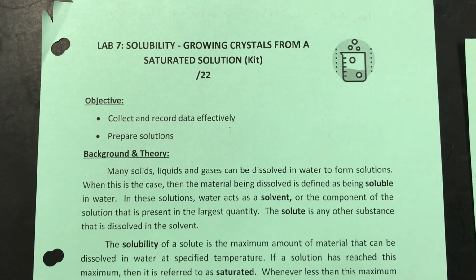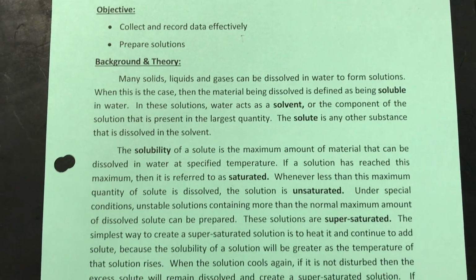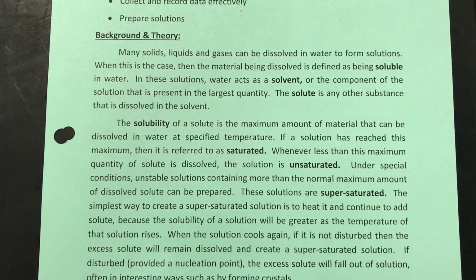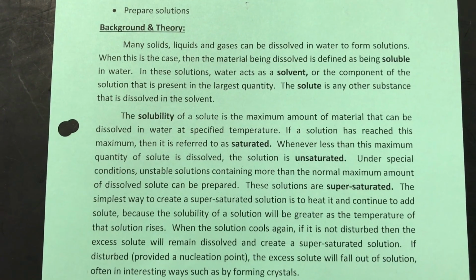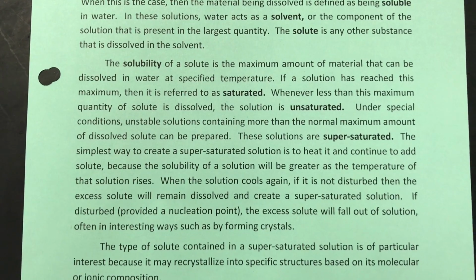This lab is based on solubility, and you're going to collect and record data and make different solutions. So solutions are a homogeneous mixture made up of a solute and a solvent. We're going to be making aqueous solutions where water is our solvent.